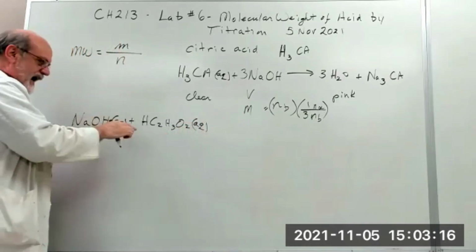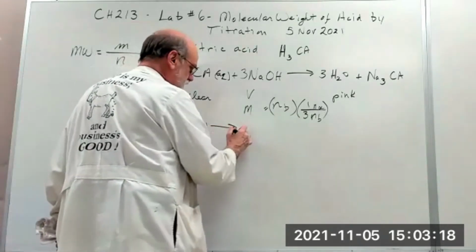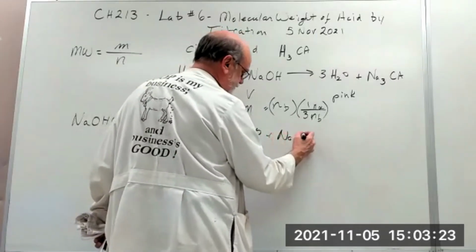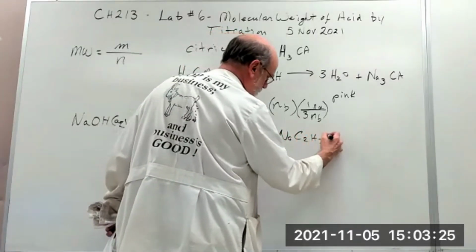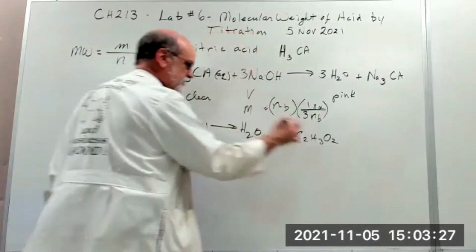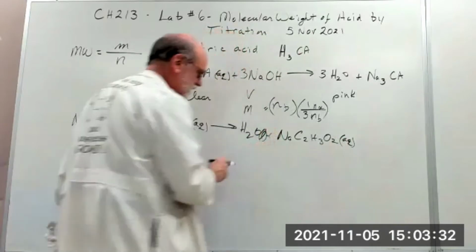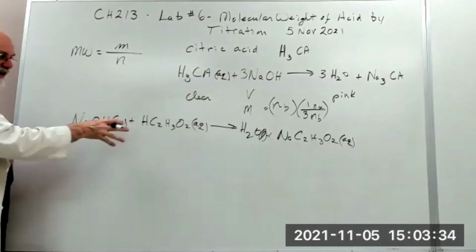Acid-base reactions always produce water and the salt. This is in solution. This is liquid. So that's our standardization equation.